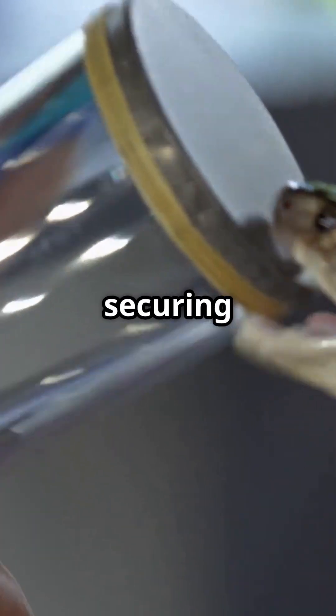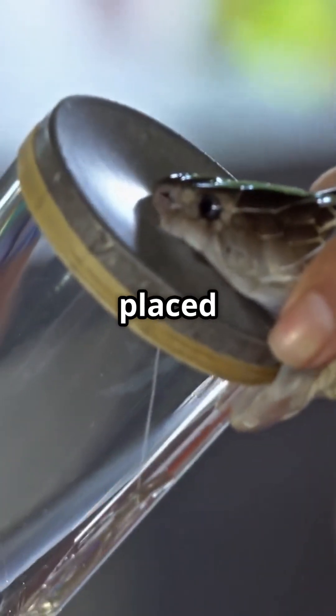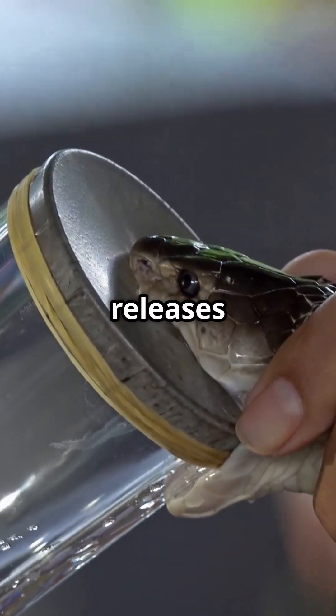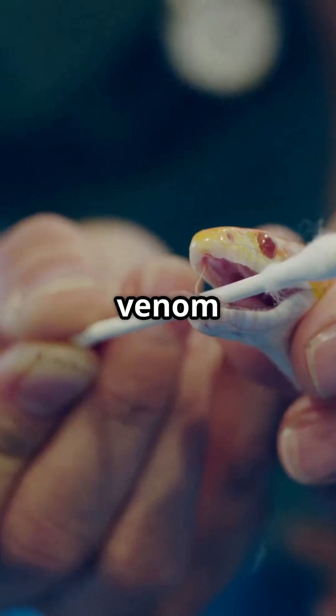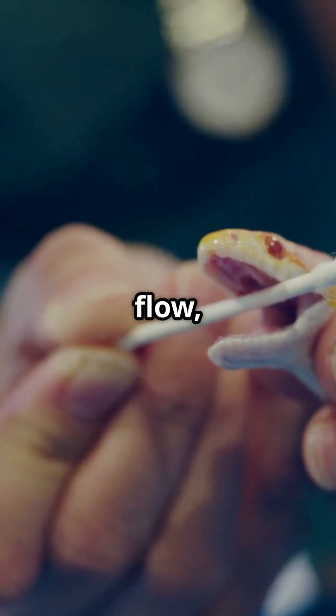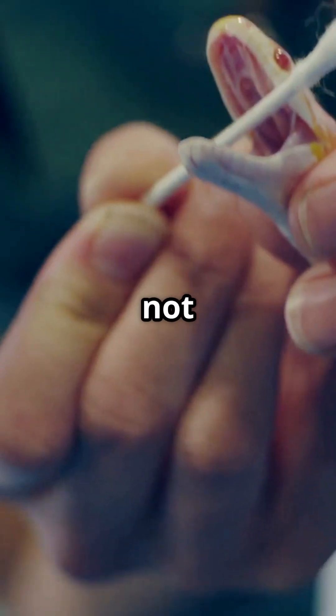After gently securing the snake, its fangs are placed on a thin membrane or inside a special tube. The snake then naturally releases its venom. The venom glands are usually gently stimulated to help the venom flow, while being careful not to hurt the snake.